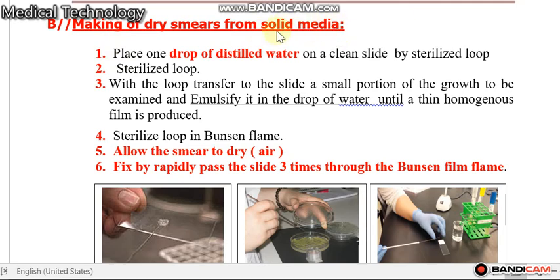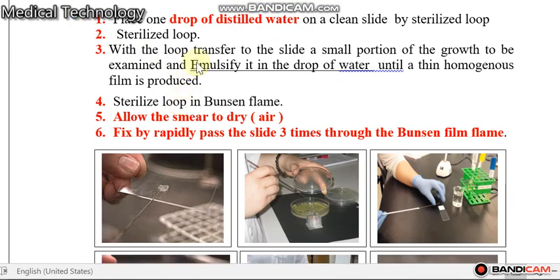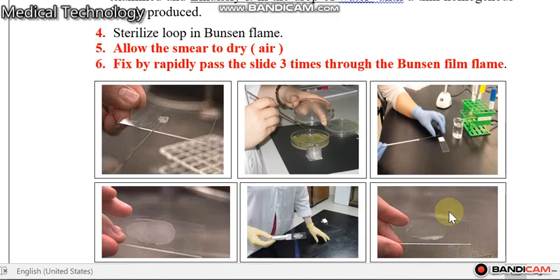وسط الزرعي صلب — كيف رح انقل البكتيرية من الوسط الزرعي إلى السلايد؟ Place one drop of distilled water on a clean slide. Using a sterilized loop, transfer a small portion of the growth to be examined to the slide, and emulsify — يعني نمزجها بحيث تكون مثل المستحلب.